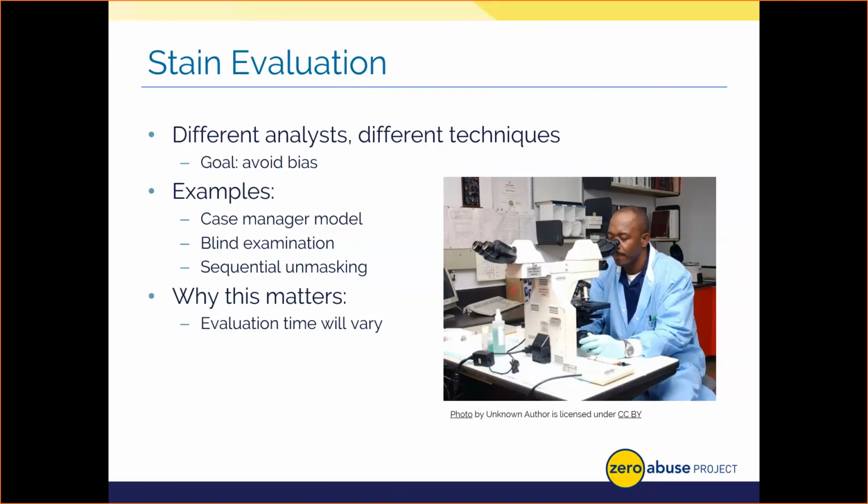I present all of this information regarding how we avoid bias in our casework for a very important reason. You should care about how a scientist evaluates an item, because this factor might just impact how long it takes to get your results. If they're going in blind with no information versus having an idea of the nature of the case, it could perhaps then take longer to process case items, as an example.